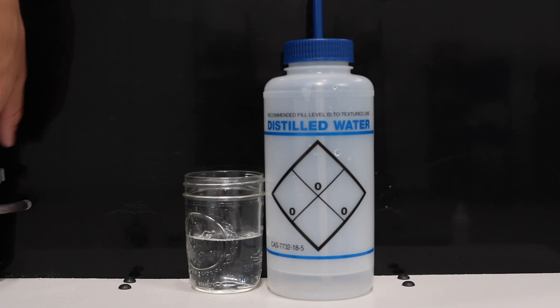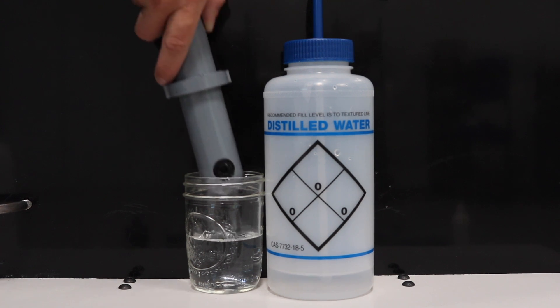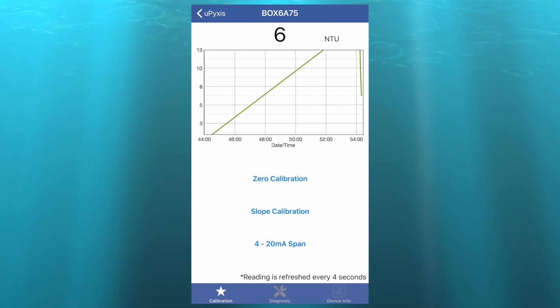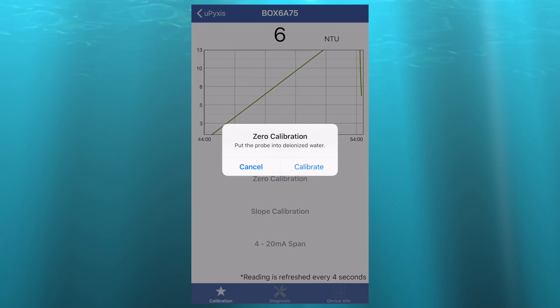To begin the calibration process, place the probe into DI water. Then on the uPixis app, select the ST730, then select Zero Calibration and Calibrate.